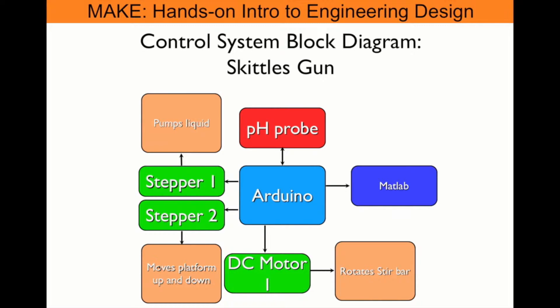Once the Arduino confirms that this platform is down and in position, it will look for a string from the pH probe. If it receives a string from the pH probe, it'll tell the stepper to run a predetermined number of steps.